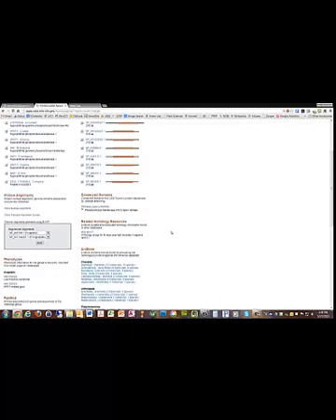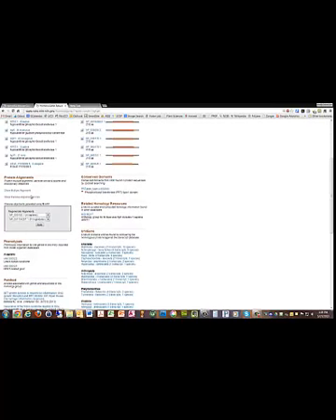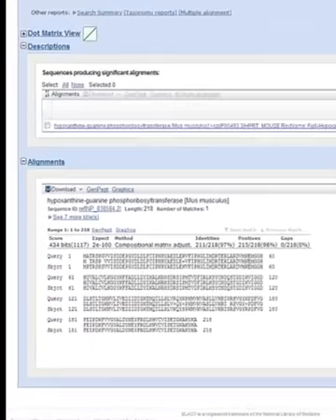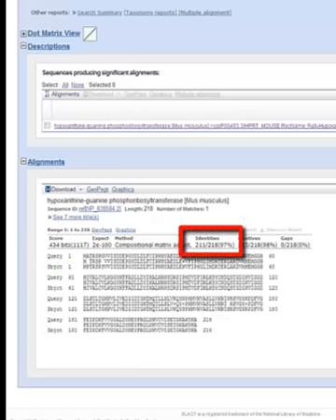If you scroll down to the protein alignment section, you can compare the protein sequences in different organisms. We'll compare the HPRT in Homo sapiens with that in mouse, or Mus musculus, using BLAST. The result shows the amino acid sequence alignment of the HPRT gene in humans and in mice. The middle line highlights the similarity by showing the amino acids that are shared between the two proteins. In this case, 97% of the amino acids in the mouse HPRT are identical to those in the human HPRT.